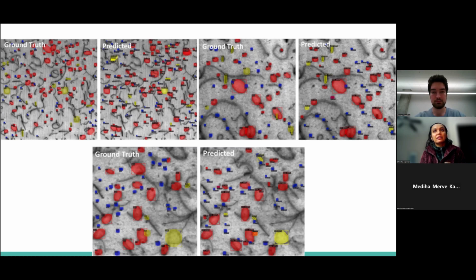And in these images, they did not care about those dislocations at the back, right? They cared about the loops, but not the line dislocations. I guess that was interesting as well. I wonder if maybe they just assume those line dislocations are there from cold working of the steel, just naturally, and they only cared about the radiation-induced ones. Hardening, not the base mechanical properties.